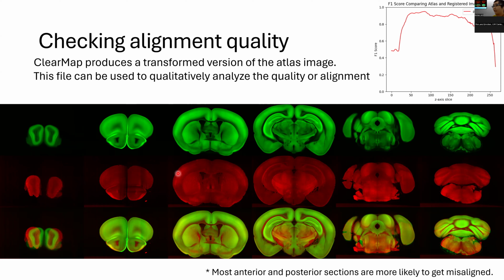You have to go into using manual approaches like Sam mentioned in the first part of the talk. Another approach is just to omit those regions. Say you have a cutoff, like any region that is after this Z position, or AP axis, will not be quantified. You can use those kinds of things to omit some of these low alignment quality regions.